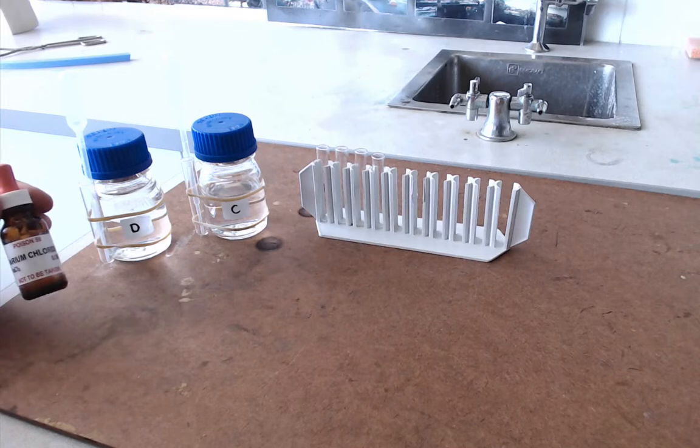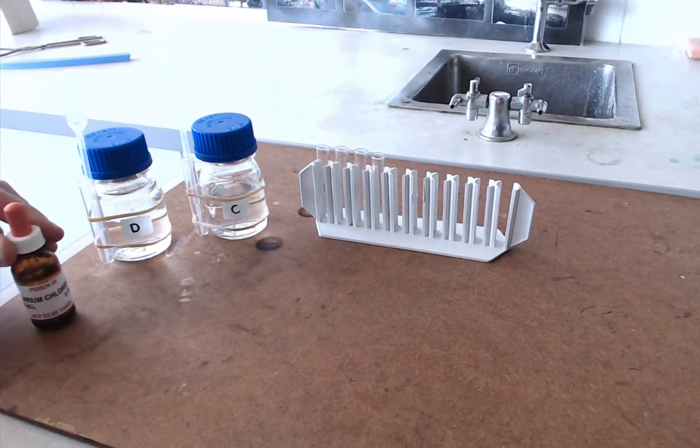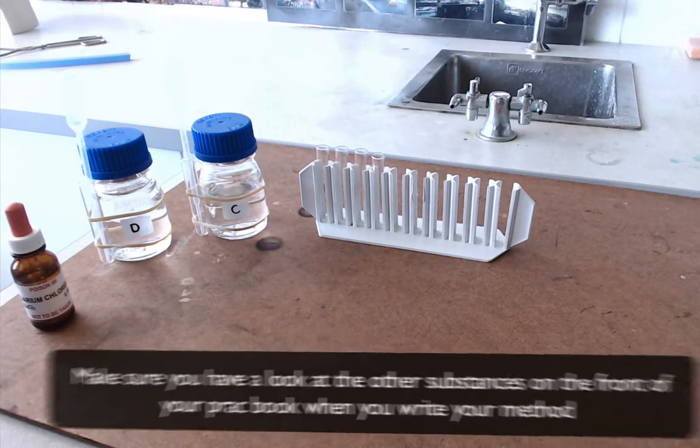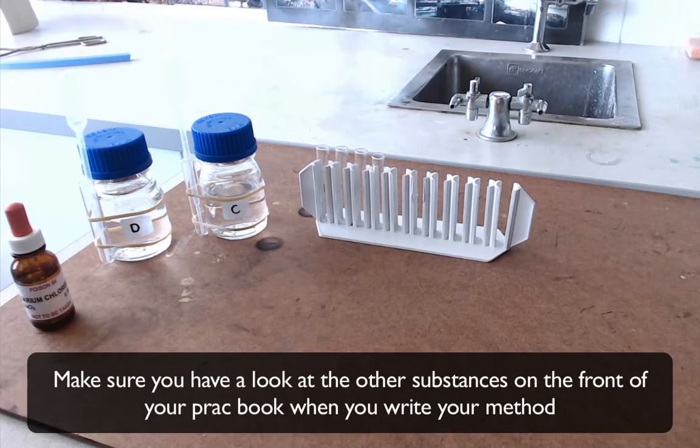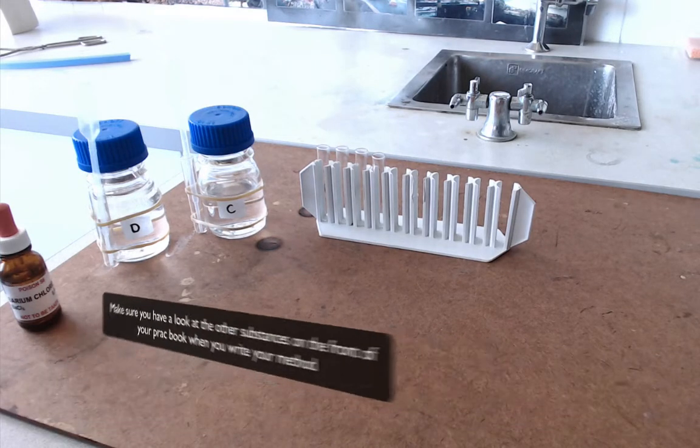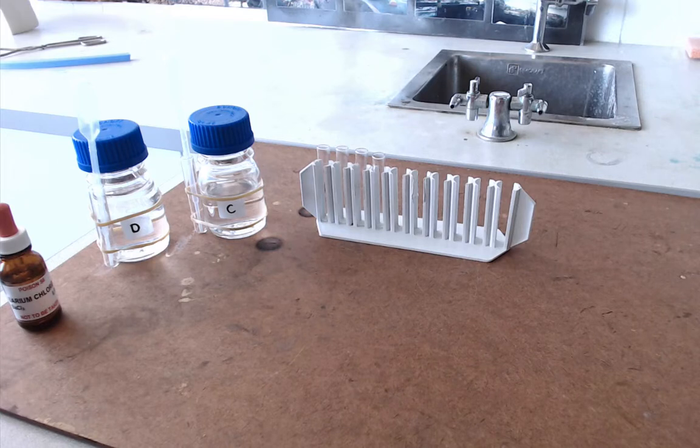C and D actually come with barium chloride, but you can see what the other solutions are when you have a look at your prac book. So as I say, it's a very simple experiment to set up.